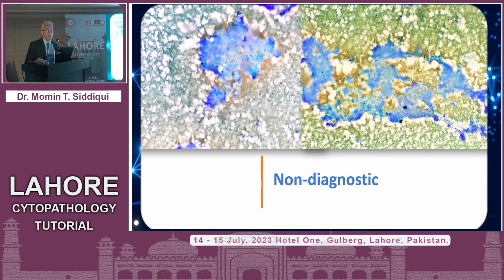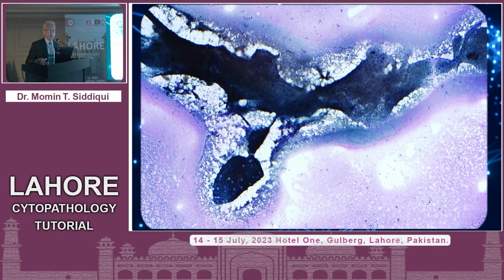So over here, what are these? Certainly these can be tumor cells. This may happen in the month of July. We have some new people on staff. So again, this is an example where wet fixed material was placed for staining, and you can really not decipher what these cells look like. So this is basically what would represent non-diagnostic.